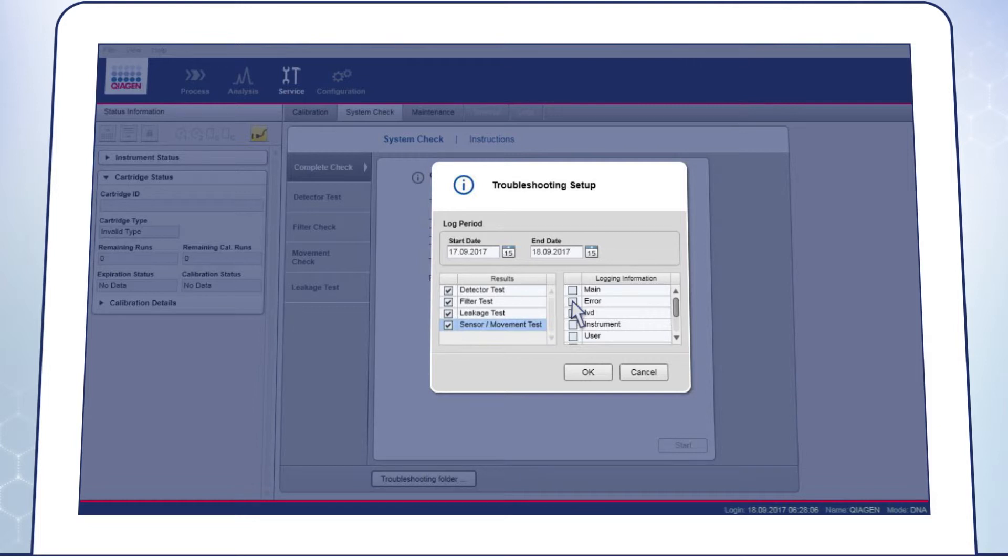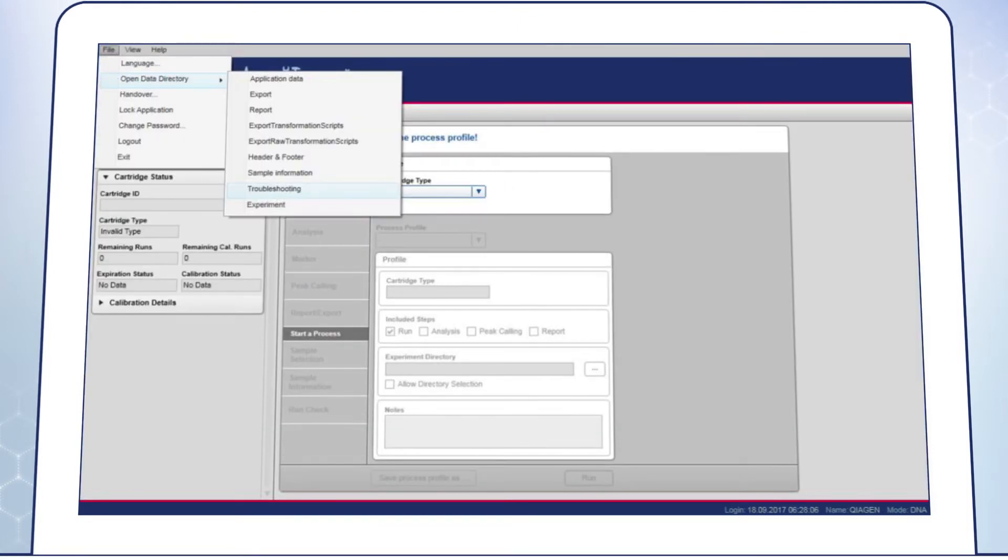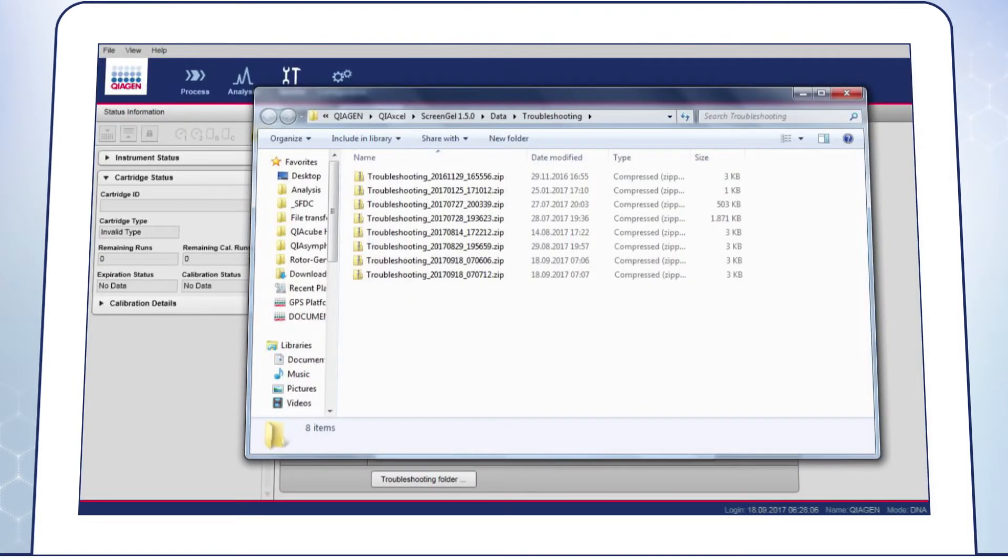On the right side, always select Main, Error, IVD and Instrument. Click OK, then go to File, open the Data Directory and Troubleshooting and then add the appropriate Troubleshooting zip folder to your email.